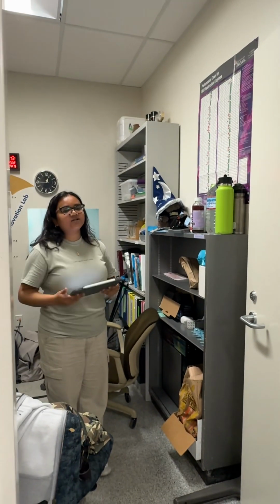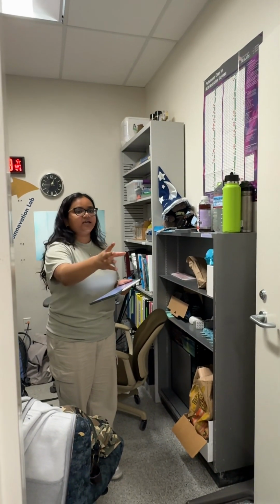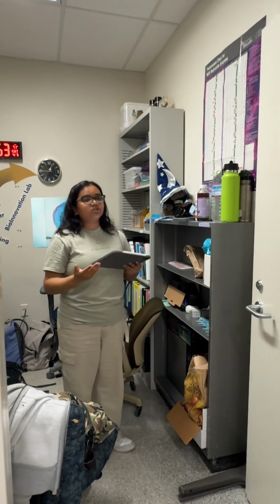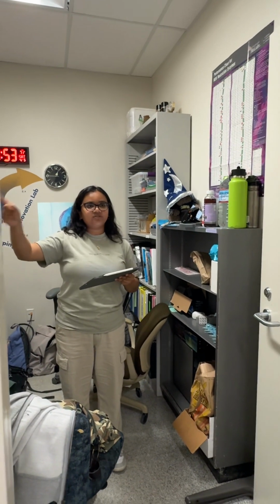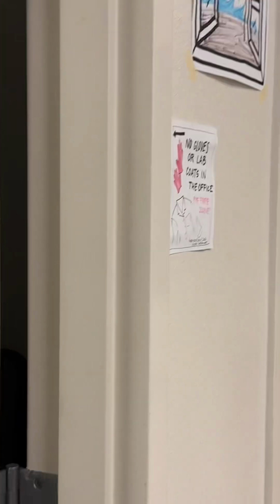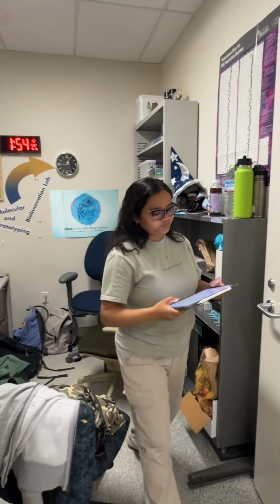And so you guys, we don't allow food or drink inside the lab. However, if you have a closed water bottle and it's completely closed, it can stay out in the lab. But if you come in with your coffee or matcha, whatever, it needs to stay over here. Anytime you need to drink water, you are welcome to step into this office or outside of the lab to take a sip of water. But remember, no PPE. These areas are like PPE free zones where you can drink and eat. But yeah, please don't eat in the lab or water bottles.